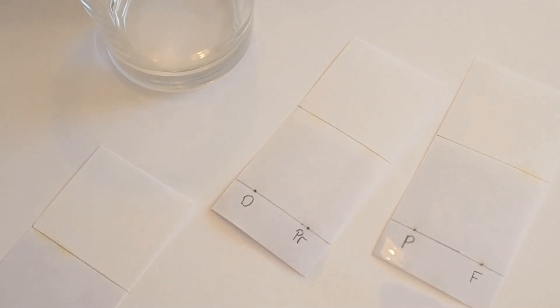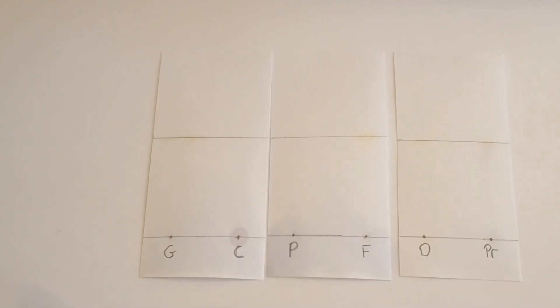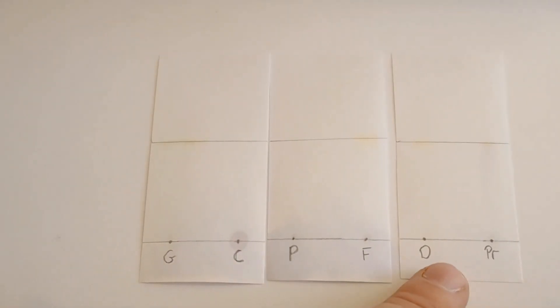And we'll see what we can see, which I know these are very faint so it's a little bit hard to tell. So what I'm going to start to do is use my pencil to circle things that I can see. So here with the primula I can see that there's still a little bit of something down here but there's also a little bit of yellow in there. And in fact, if you see, you might be able to see some faint streaking of a purpley light colour. There, so I'm just going to do that like that.